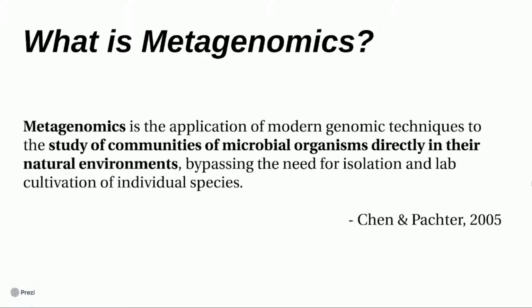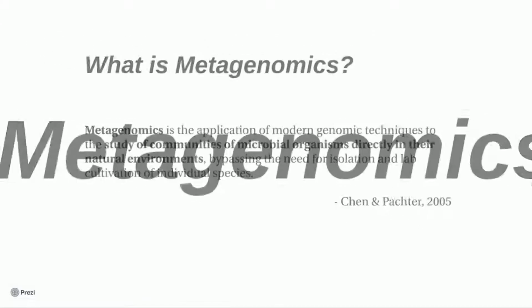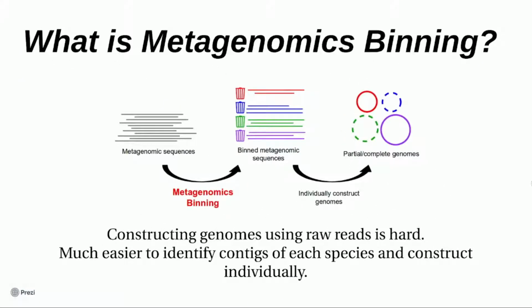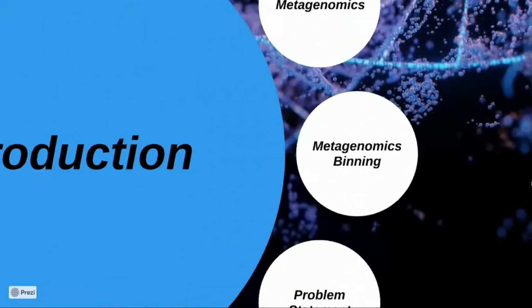Metagenomics involves the study of various genetic material obtained directly from communities of microorganisms living in natural environments. Metagenomics plays a vital role in applications such as water quality control, clinical disease diagnosis, and pathogen studies in agriculture. The binning step in metagenomics is concerned with separating sequences belonging to different microorganisms into bins such that each bin consists of sequences belonging to one microorganism.